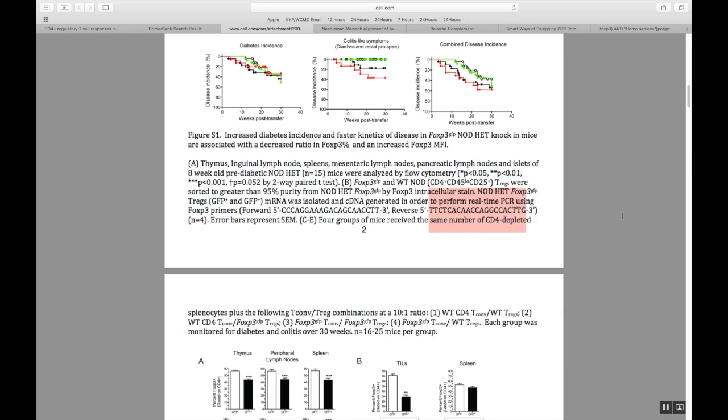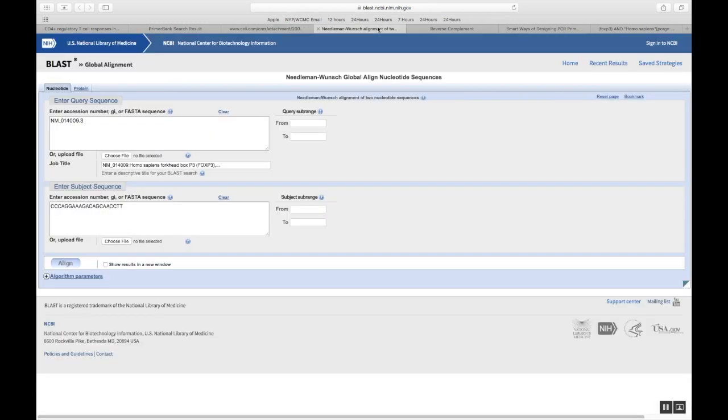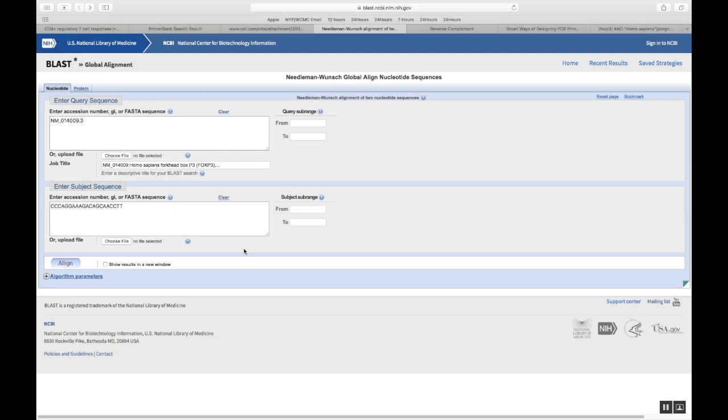As you know, the reverse primer sequence, if you enter it straight away, it's not going to show you anything. Because you need a reverse complement sequence for your reverse primer in order to see where it stands on your cDNA. How to get that? For that, you need to go to another site.